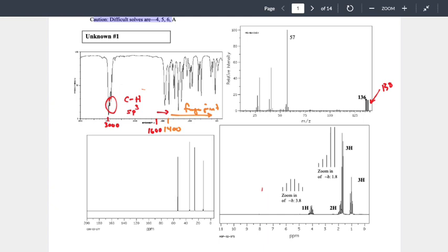If I look at chlorine, chlorine has 2 common isotopes, chlorine 35 and 37. Okay? So that M+2 is really saying, do we have evidence that bromine or chlorine are present? So in this case, yes, we have an M+2. Now we've got to decide, what does this information mean?